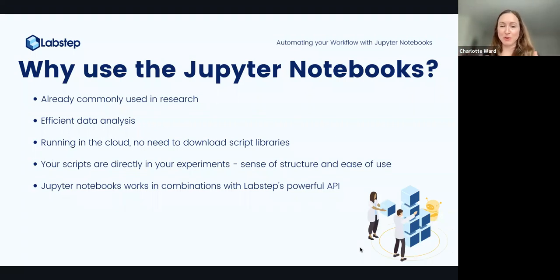Most of what we do is through a user interface where you're clicking on things and dragging and dropping things and all that kind of stuff. An API allows you to do essentially all the same things, but it gives you a bit more power, and you would access it by running a script that carries out the particular functions you're after. So, for example, if you wanted to bulk upload 2,000 resources, you could do this much quicker through the API to get everything in this sort of structure that you're after.